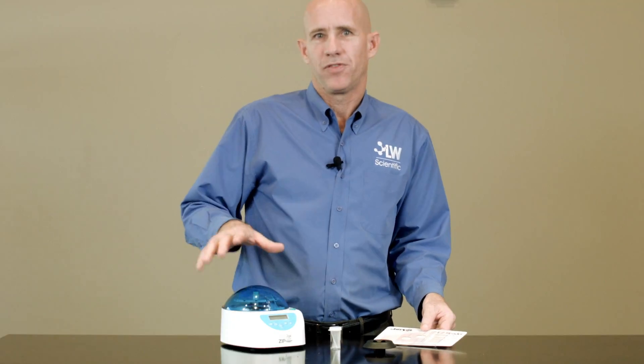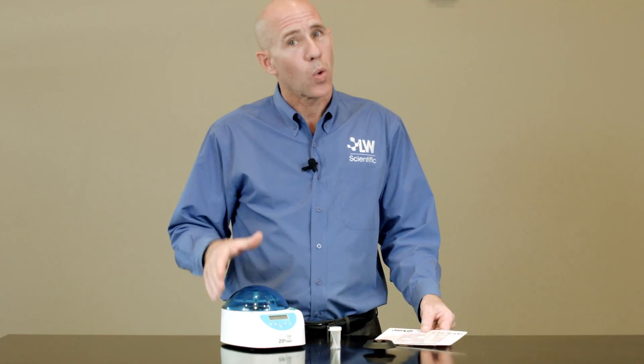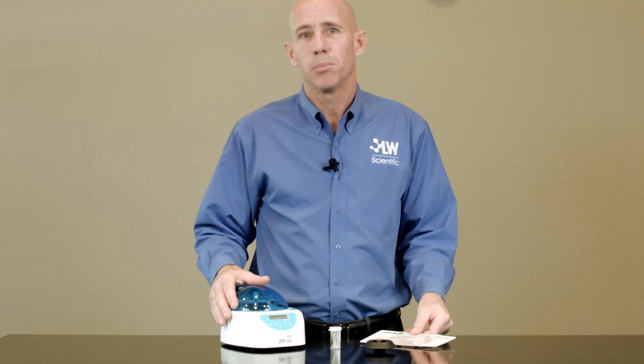Its small footprint fits easily into any lab space, its quiet operation keeps the work environment peaceful, and the small price fits any budget. Contact your Jorvet sales rep to try the new Zip Combo Centrifuge today. Thank you.